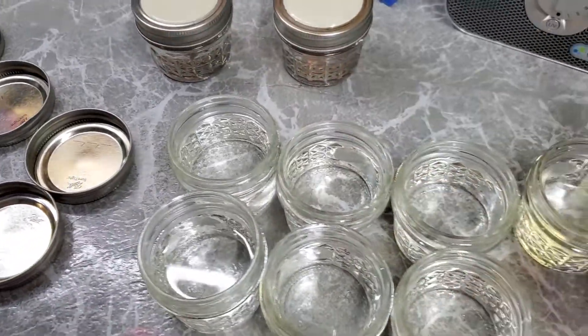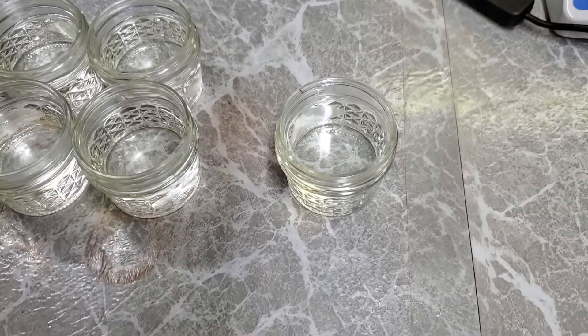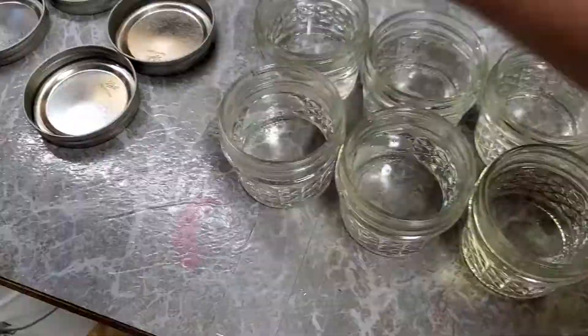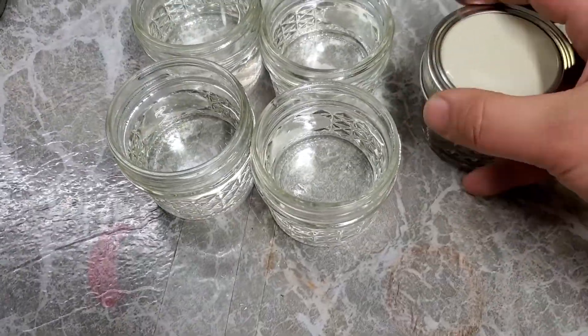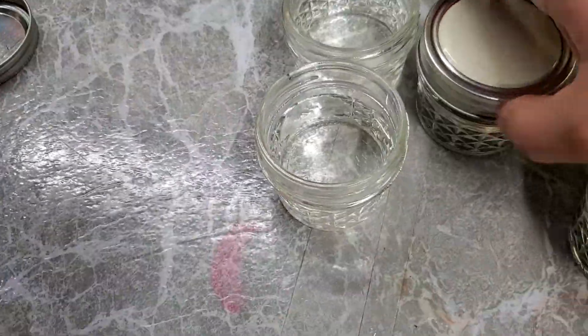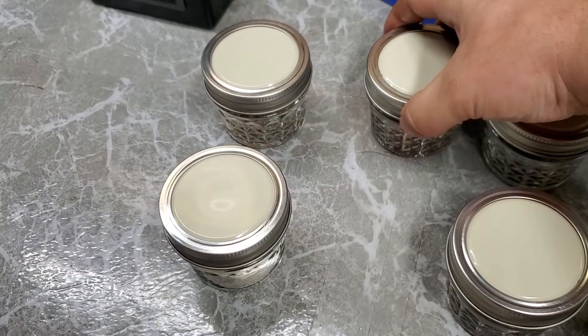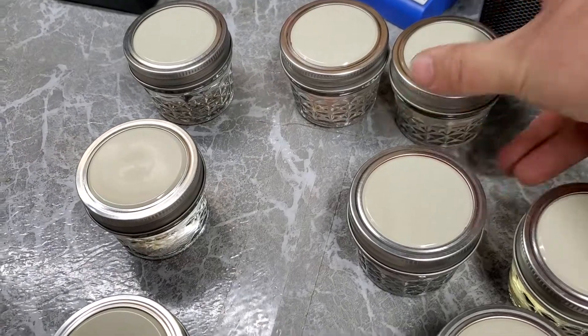Set that aside and do that for the rest of them. You don't have to absolutely tighten these to the point where you can't get them off again. Just hand tight is fine. All right. Now, since they are all sealed up, all we have to do is sterilize them.